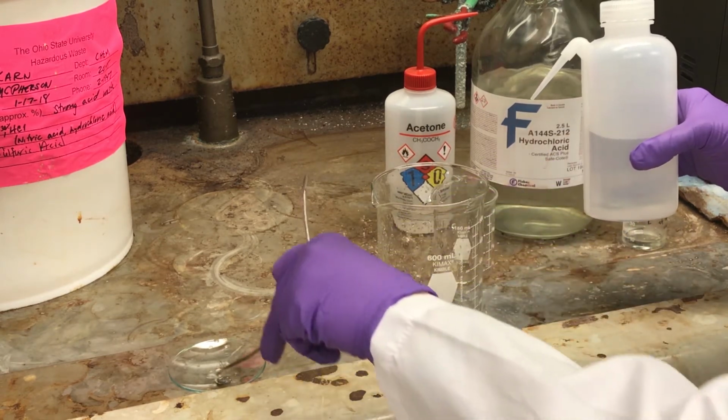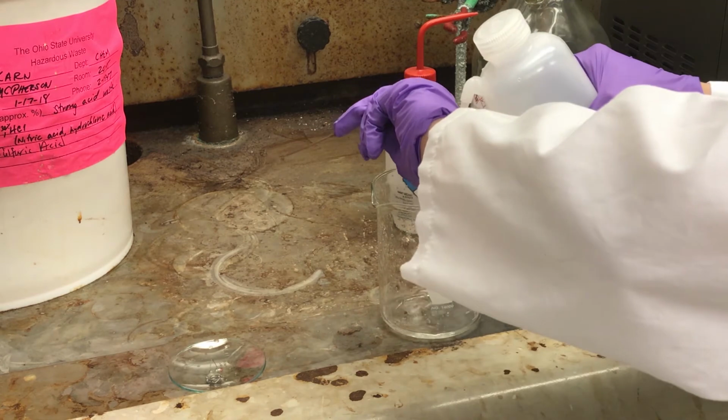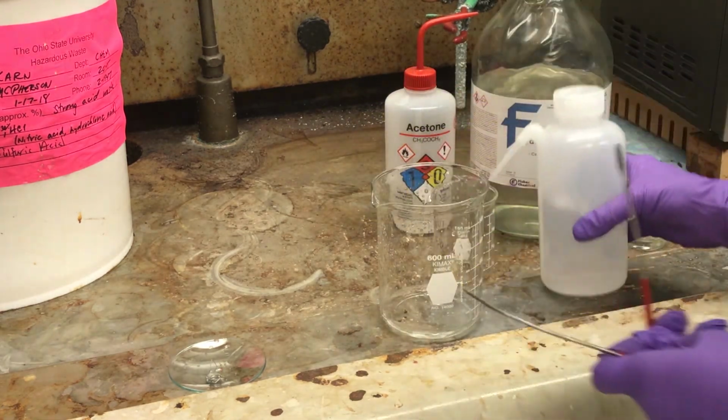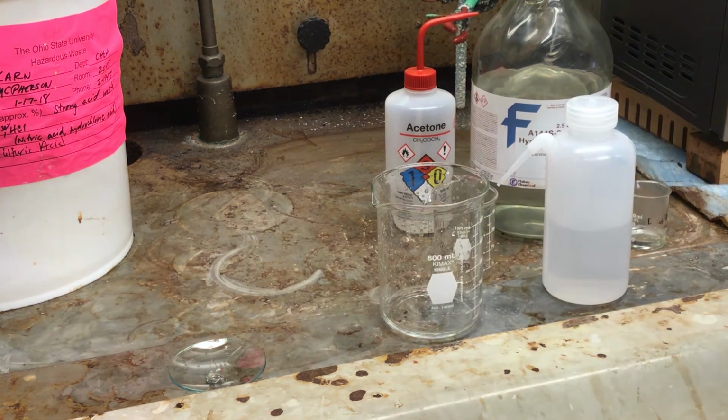Now that that's rinsed, I'm going to place it here on my watch glass. Rinse off my spatulas. Okay. So it's probably a good idea to get a clean, dry watch glass at this point.